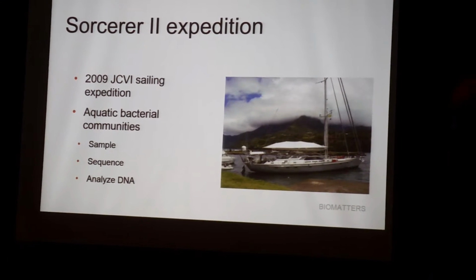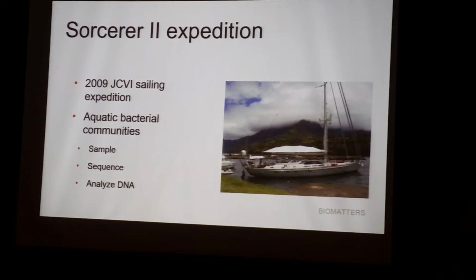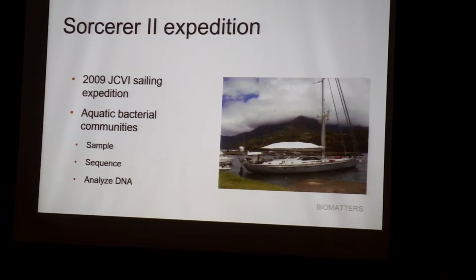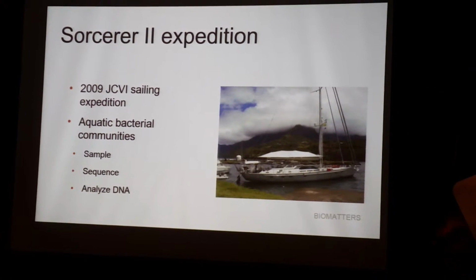They filtered these samples with progressively smaller filters and collected microorganisms to see the biodiversity of microorganisms in water.